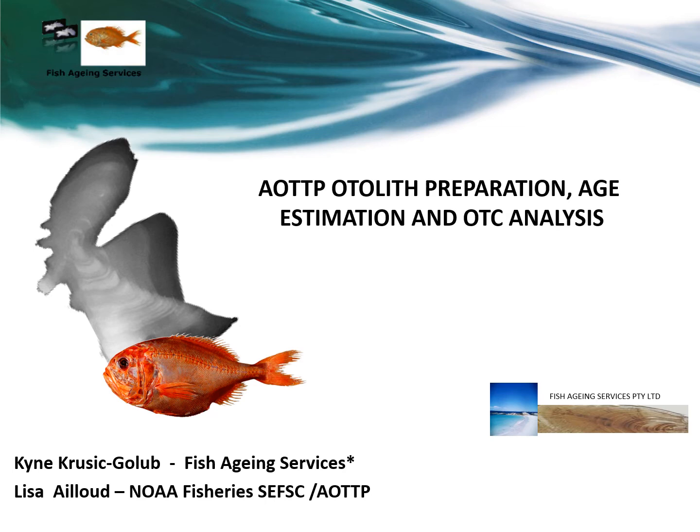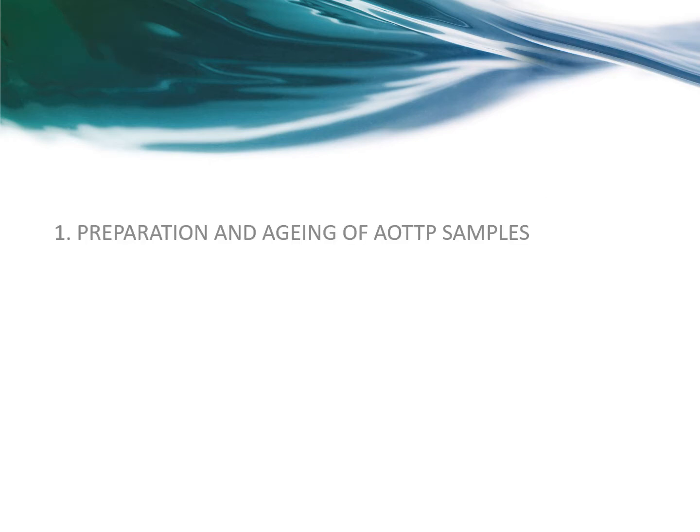Today I will be presenting some work that we have conducted on a small number of marked and recaptured otoliths from the tagging program. The presentation will be in two parts. One, the preparation and aging of those samples, and two, the OTC detection and analysis.